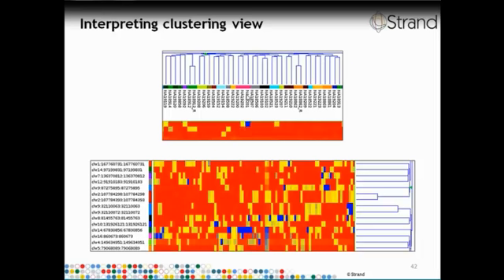So the targeted region QC workflow step in Avadis NGS allows you to take a region list and analyze it, and it annotates each region with the number of reads that fell in that region in a particular sample and the average coverage in that particular sample. So it adds these 2 columns for every sample present in the aligned read list. In our case, we have 96 samples, so there will be 192 additional columns that are added to the target regions.